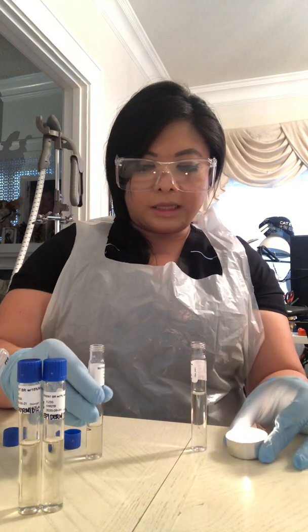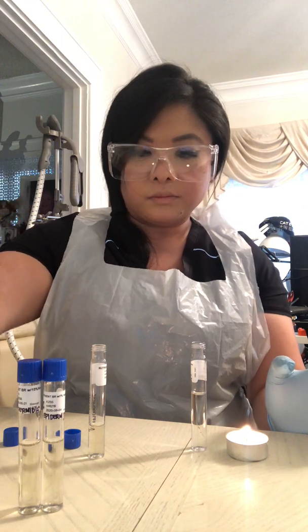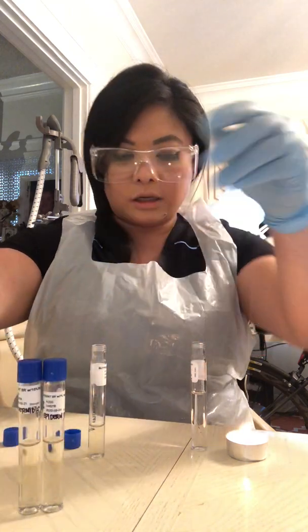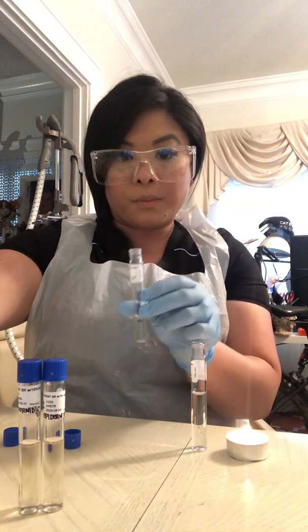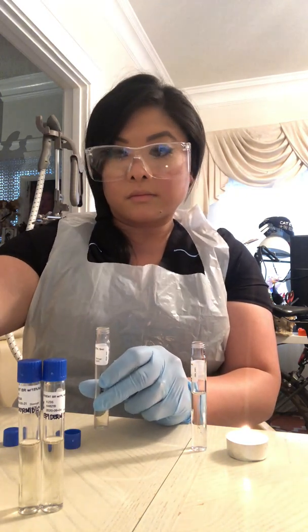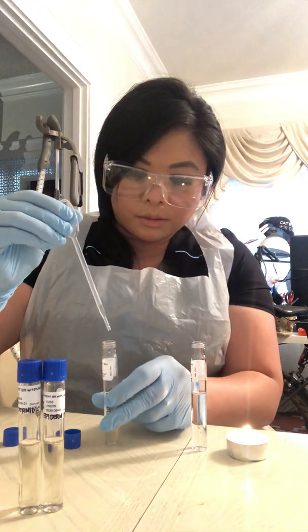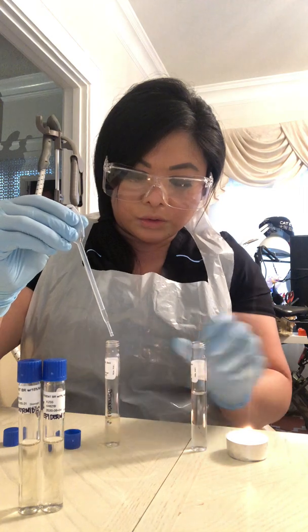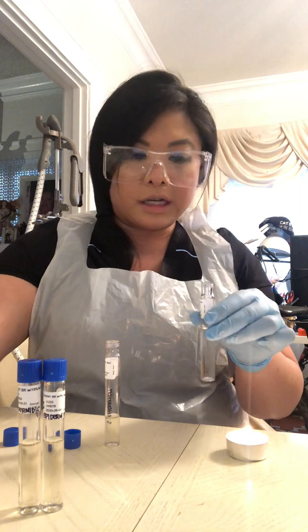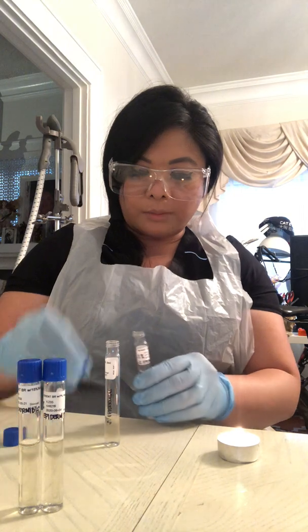And then I have my pipette that's been sitting in alcohol. I have to make sure that it's dry. Then I'm going to collect 2 drops from my S. epidermidis broth, and I'm going to transfer it to my sodium chloride, just 2 drops. Then I'm going to sterilize the lid again of both, and then I'm going to recap it.